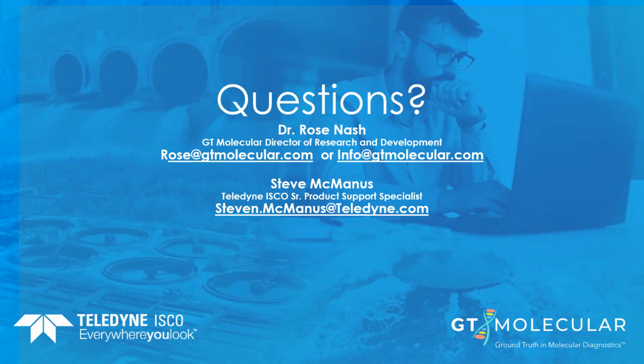Now, in the case of an autosampler, we use a strainer in front of the suction line. So it filters the large particles, and you don't get those in your sample. That's why the automatic sampler helps in this kind of study in a much better way. But I can request Dr. Nash to comment on what the virus affinity with the solid particle is.